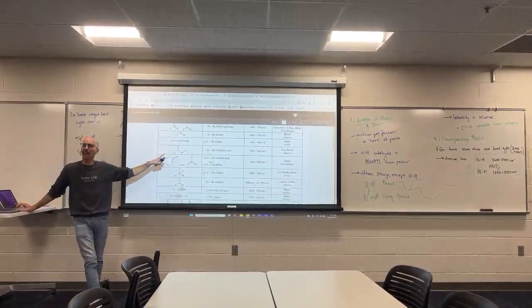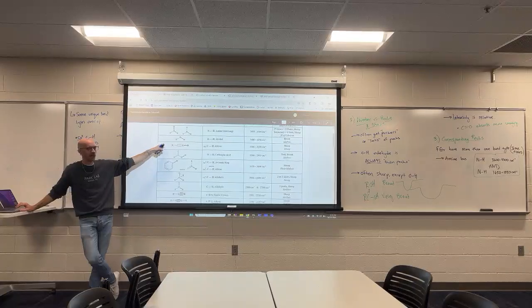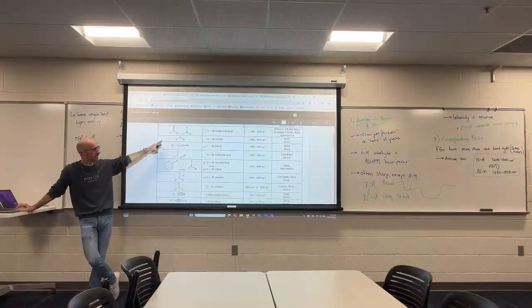You know, alcohol is actually not that important, in my opinion, because the alcohol is pretty unique in that the OH is broad. It kind of stands alone.